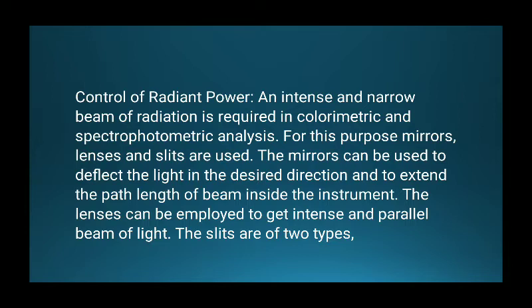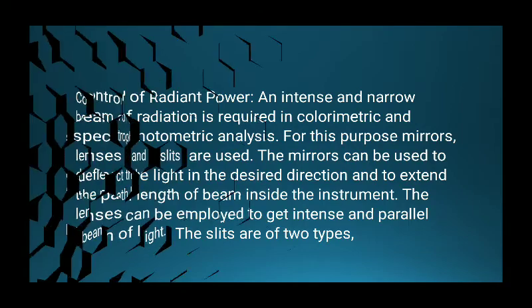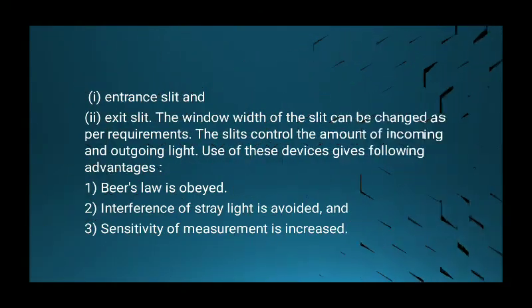The slits are of two types, entrance slit and exit slit. The window width of the slit can be changed as per requirement. The slit controls the amount of incoming and outgoing light. Use of these devices gives some advantages such as Beer's law is obeyed, interference of stray light is avoided, and sensitivity of measurement is increased.